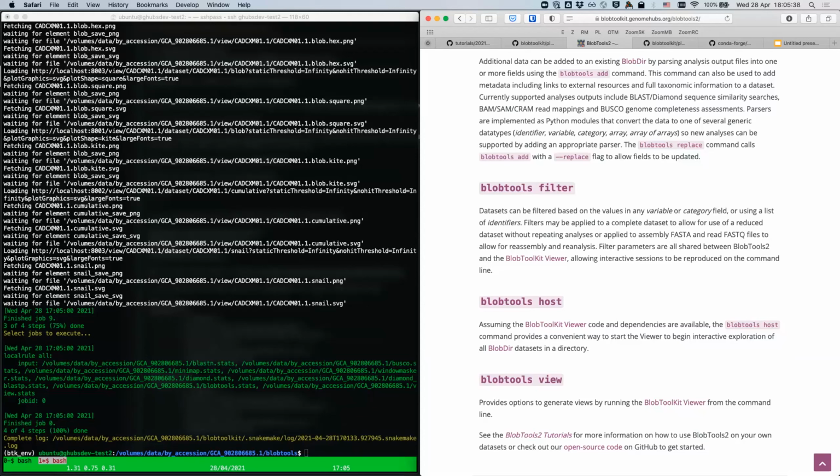Nicola's question is, if I ran BlobTools on my genome with V1, should I be repeating it with V2? I think so. But if it takes too long because the blasts take too long, don't bother. It's up to you. I think you should, because you'll get some new features which are quite nice, but you don't have to. The old one does work. We have new taxrules and they're not all documented, unfortunately, but I'm happy to answer any questions if you put them in an email or in GitHub issues.